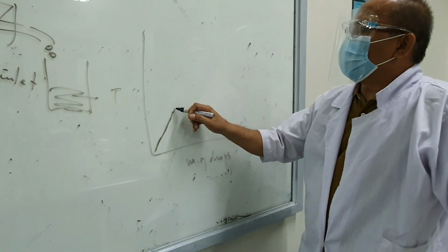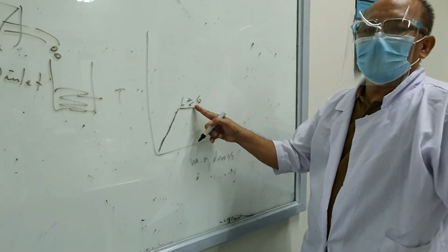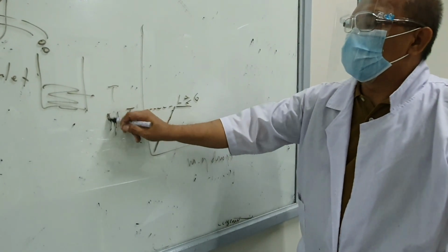But once the liquid starts to boil, there is equilibrium, and at equilibrium there is no change in temperature. So you call this the boiling point.